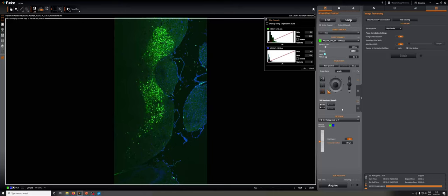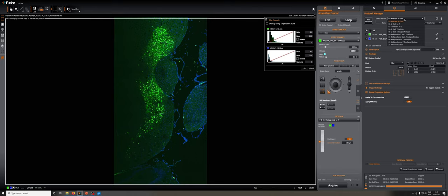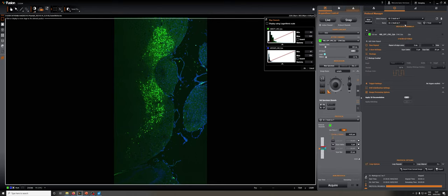Let's discuss some other possible protocols. I'm going to go back to the protocol manager. Instead of using a montage with no Z and no T, I'm going to use a Z stack with no T, so I can show you what's involved in that.